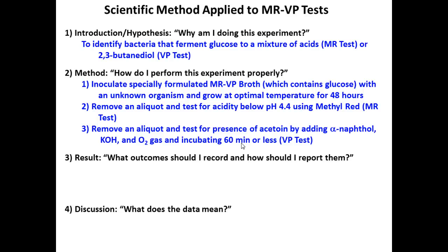What color did you see if it was positive? You should have seen red, right? So hopefully everyone's got your correct results. I'll check in with you guys once we get finished lecturing today and make sure that you guys have got what you should. So what do the results mean?